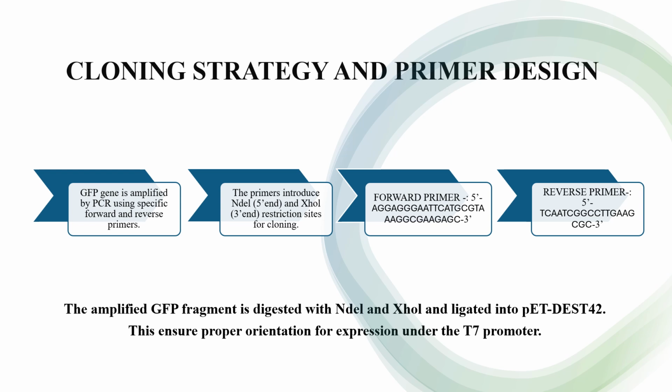For successful cloning, primers were designed to amplify GFP while introducing restriction sites for proper insertion. In the forward primer, we have the NdeI site, which ensures precise cloning into PET-DEST42. And for the reverse primer, we have the XhoI site that facilitates proper vector ligation.